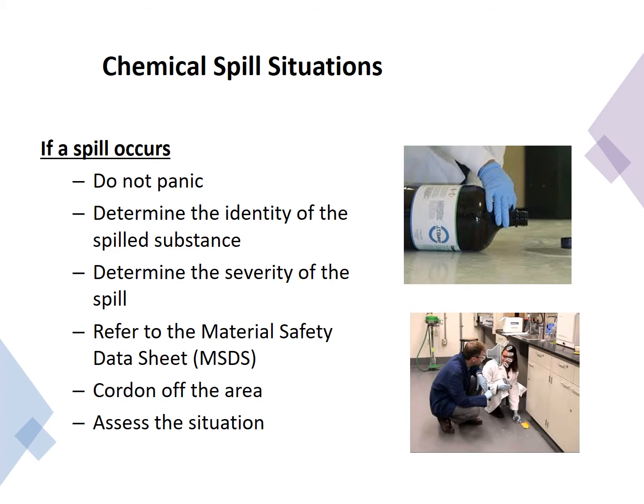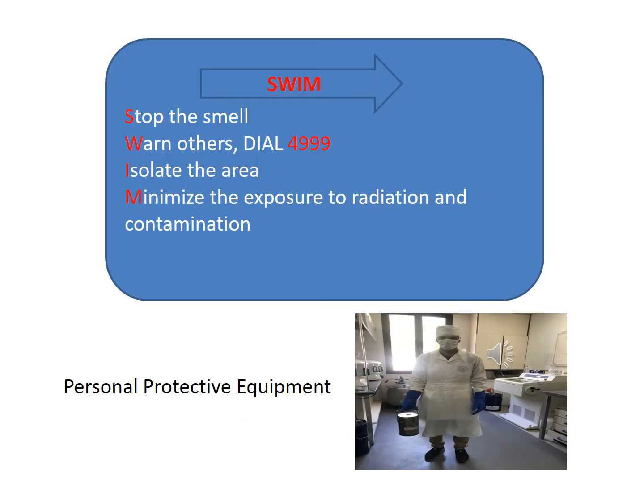While dealing with a spillage, whether it is chemical or biological, you have to follow the universal rule, SWIM. SWIM is an abbreviation. S stands for stop the smell.